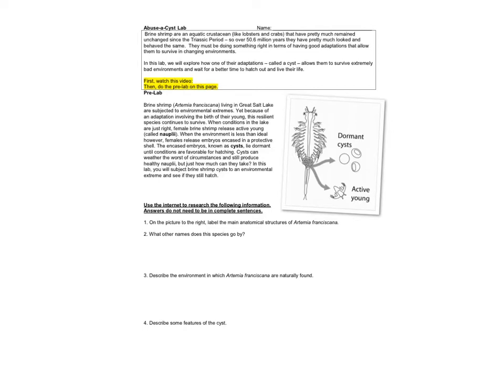In this video, I'm going to go over the A Cyst Lab. This is a lab that looks at cysts, which are little cases that embryos of brine shrimp live inside. So this guy here is a brine shrimp. You may have heard of a sea monkey.